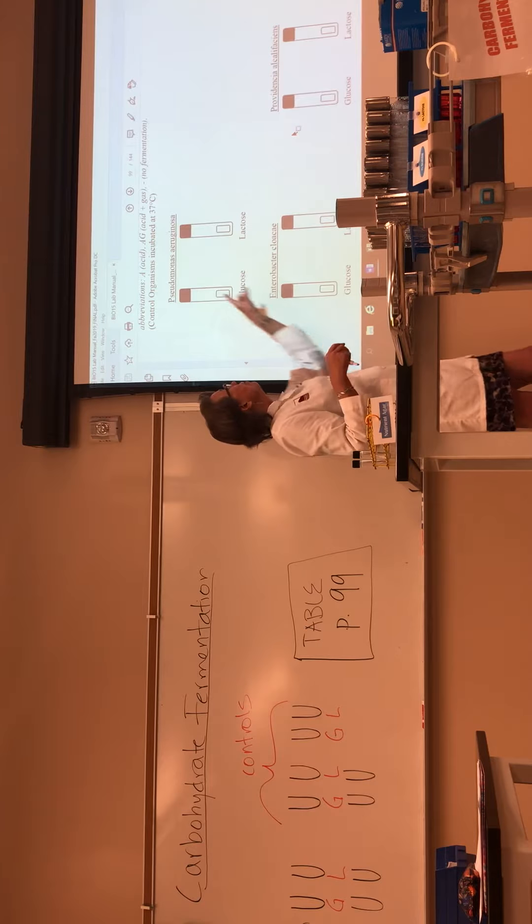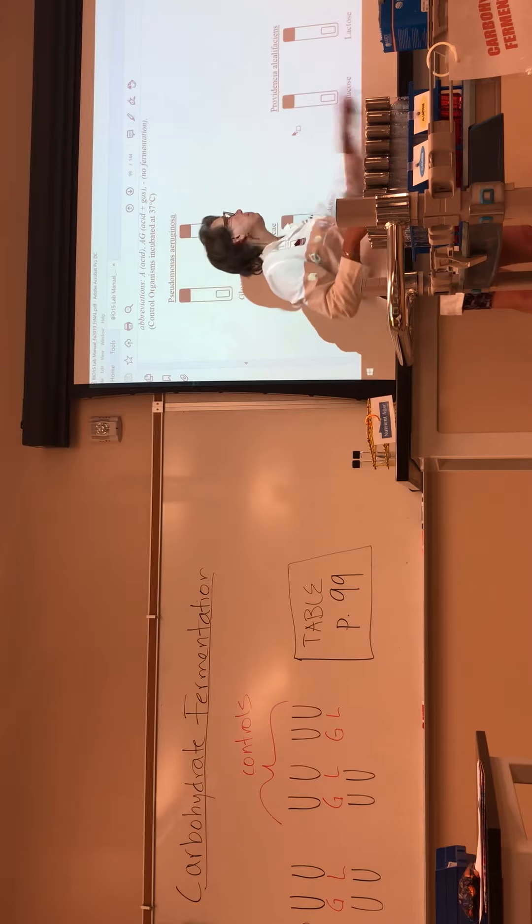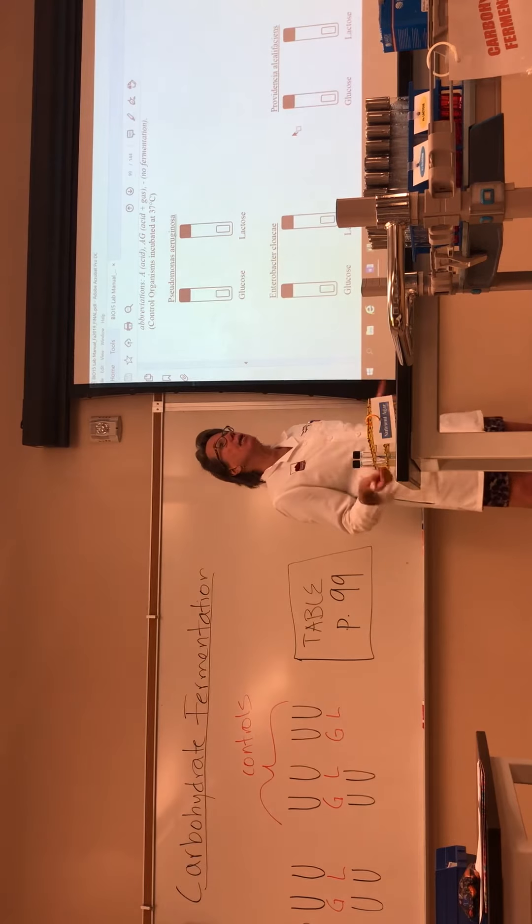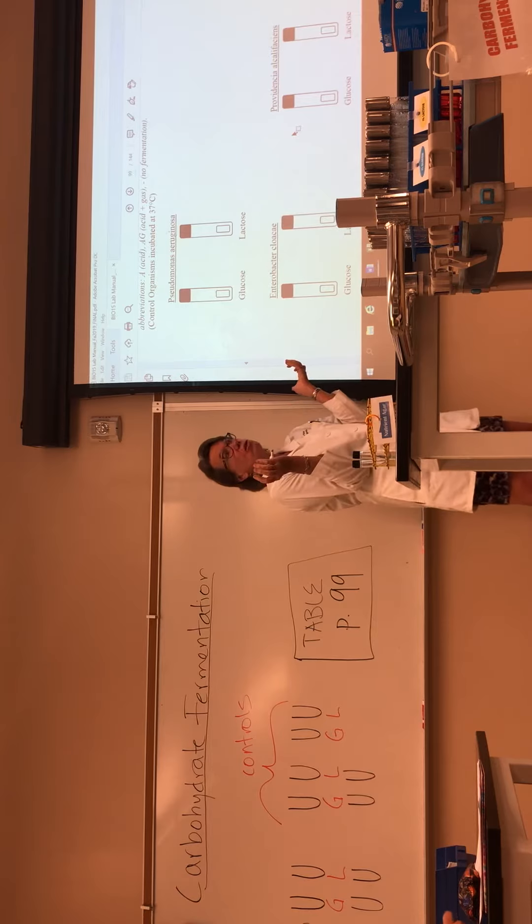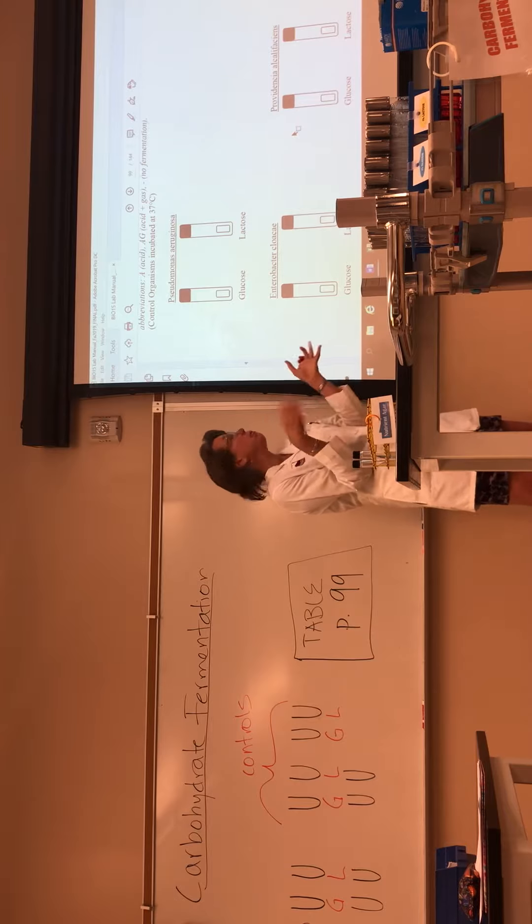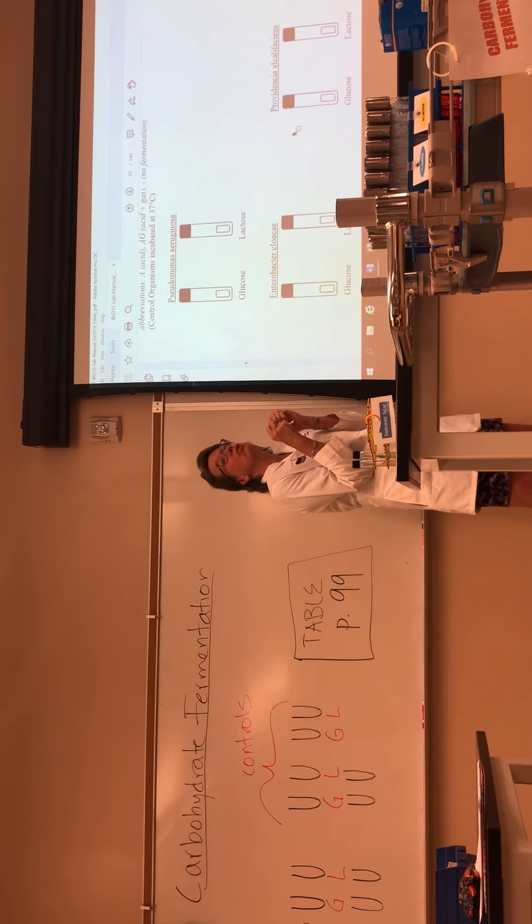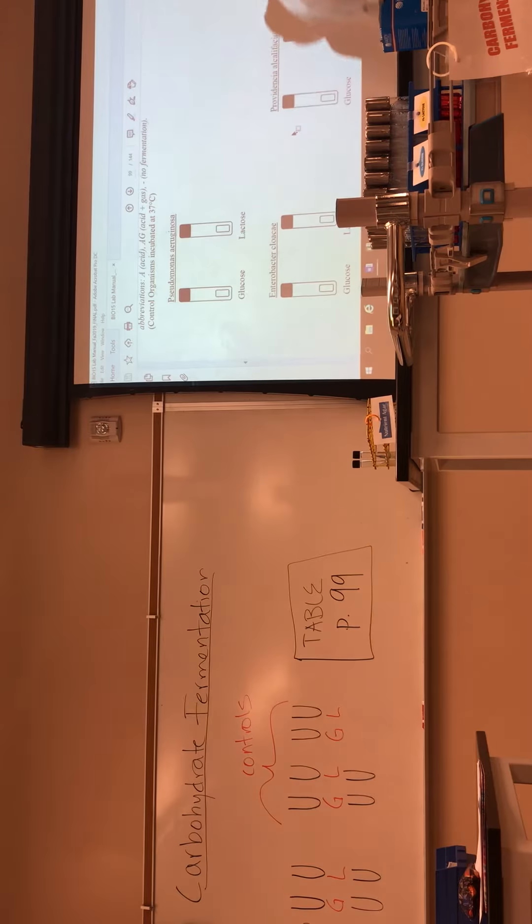Anita is going to inoculate three control organisms—Pseudomonas, Enterobacter, and Providencia—to show you that some bacteria can ferment all of those sugars, some bacteria can't ferment either one, and some can only ferment one of the sugars.